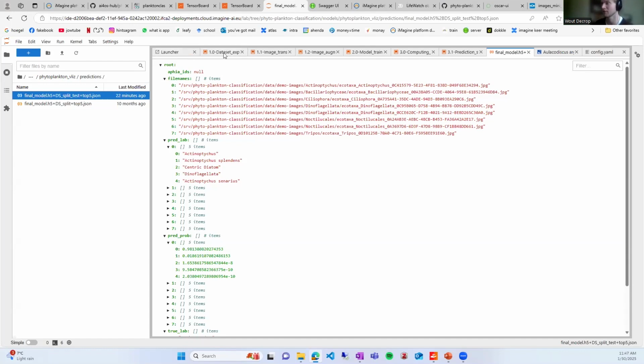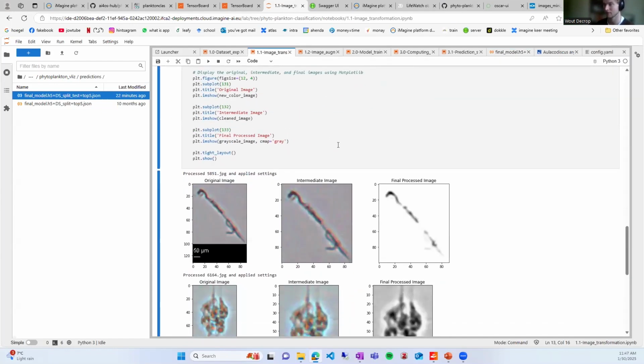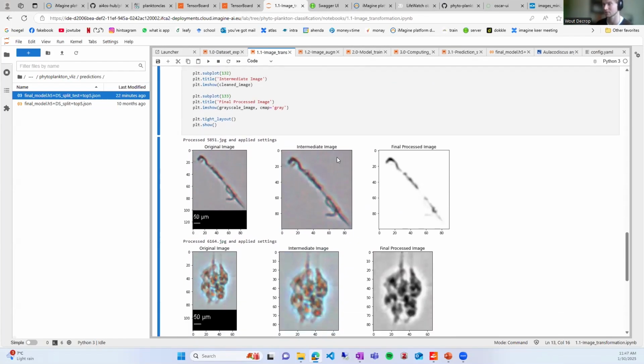So we've been looking at new FlowCam versions. That's why I made the transformation script. And we have ordered a new one at FlowCam, and we're just starting to create samples. So as soon as we have a big enough data set, I would like to train a new model with the colorful FlowCam images and use the weights of our gray trainer, and then create a bigger data set, and then at the end make a new classifier for this new FlowCam by expanding the data set. But through this platform I've not looked at any other non-FlowCam images.